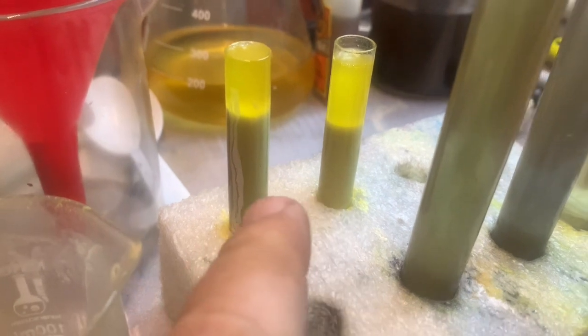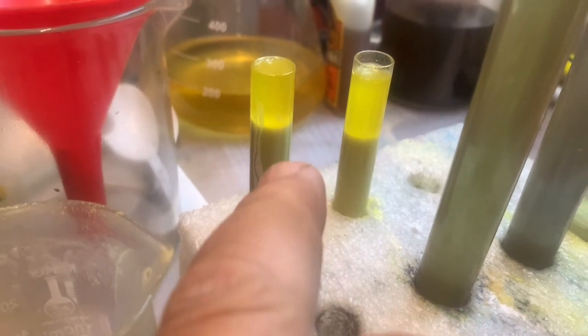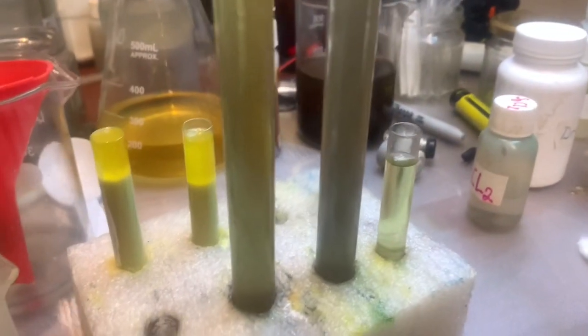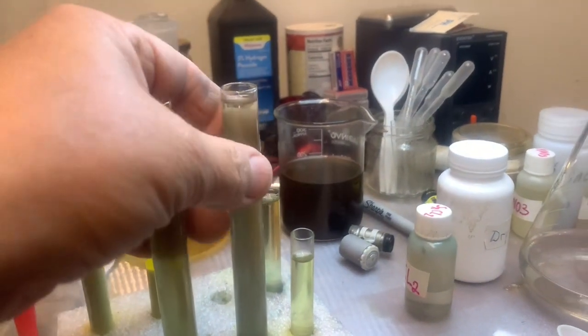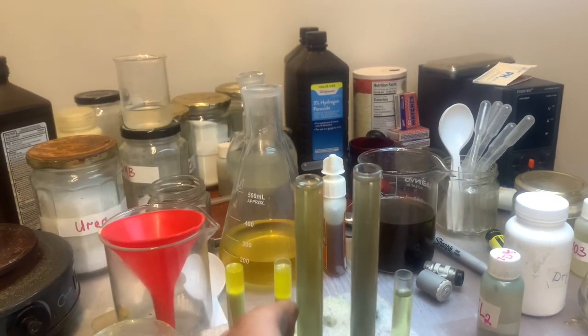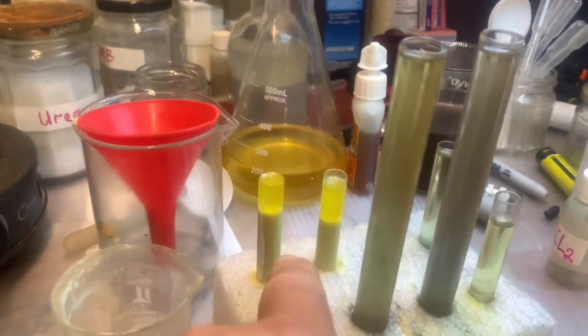Oh, look, there is some silver chloride still settling, but there is still gold inside, so I need to wait till everything finishes settling down, then I take that juice and precipitate the gold. So right now it's still not clean, still settling down. And maybe it needs another few hours till the solution becomes clean. That much gold was in one little rock, okay? That is still there, but it's silver, a lot of silver.